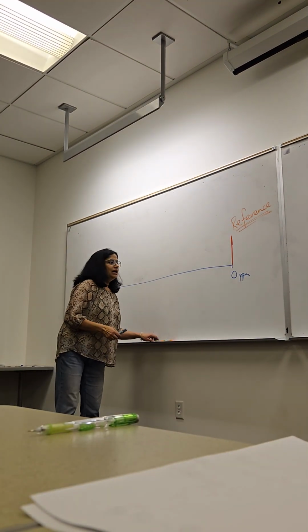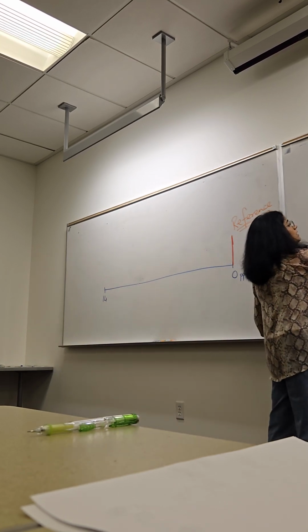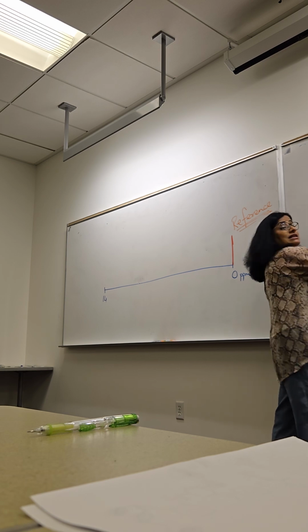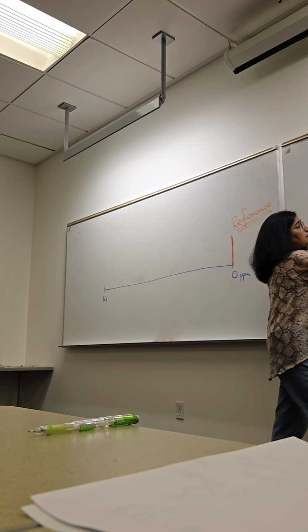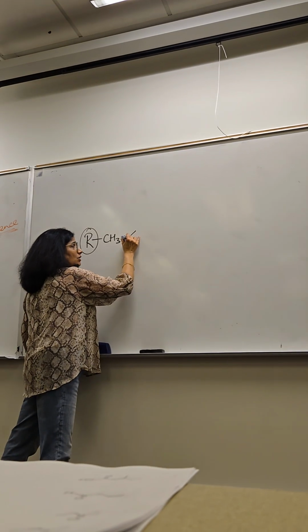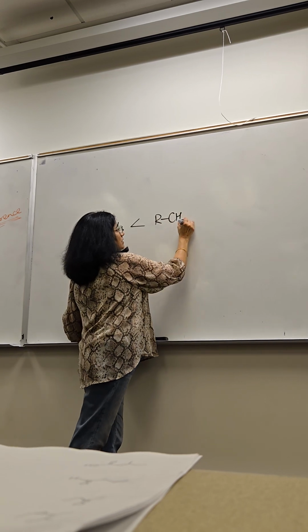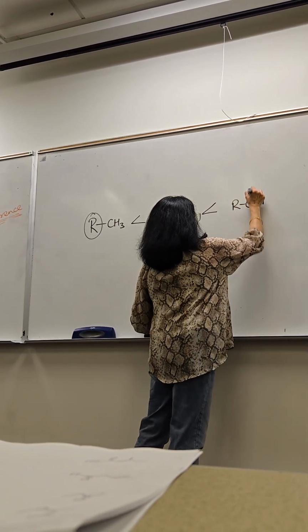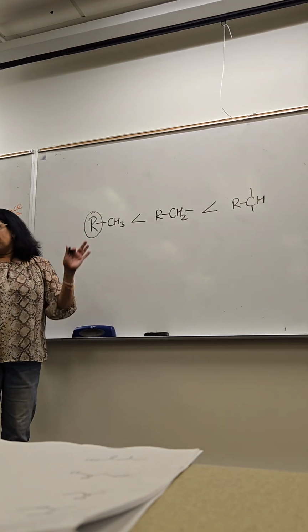One bottom line you will have to keep in mind in NMR, no matter what kind: everything else being the same, a methyl signal will be slightly lower ppm value than a methylene signal, lower than a methine signal. So just to give you an idea, everything else being the same.